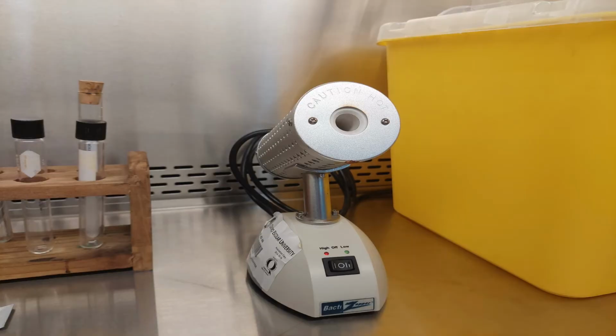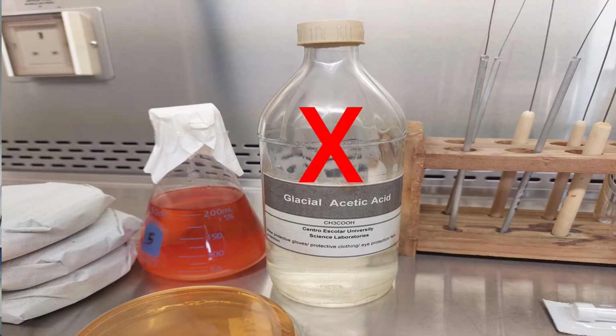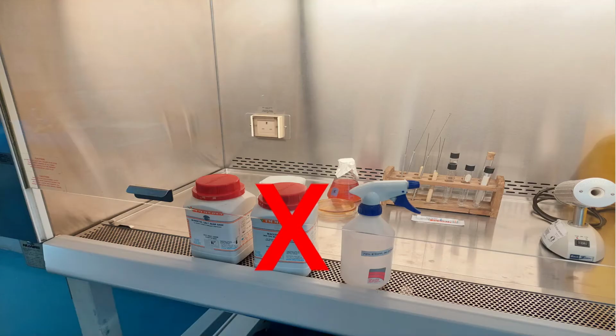Use disposable sterile loops when possible. Do not use biosafety cabinets when handling toxic, volatile, or flammable materials. Do not use the cabinet as a storage area. Overloading the cabinet with unnecessary items can affect the cabinet's airflow and containment.